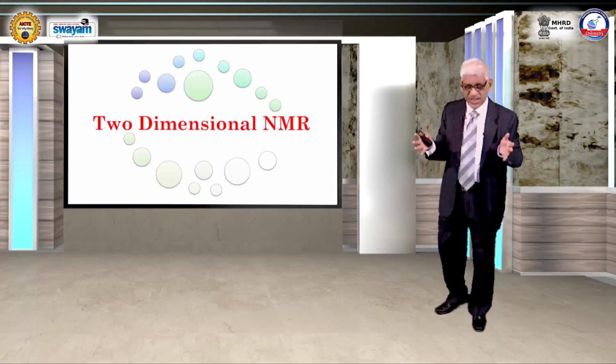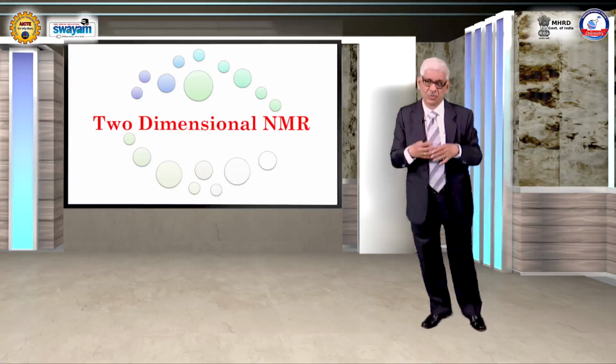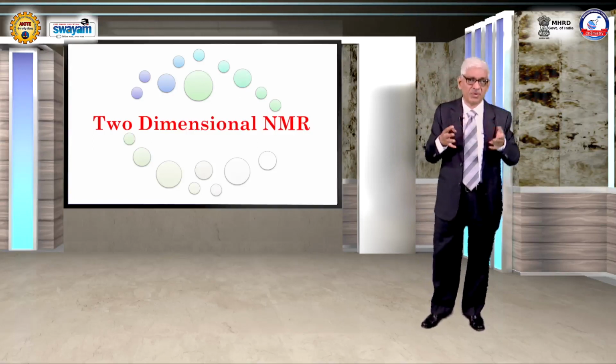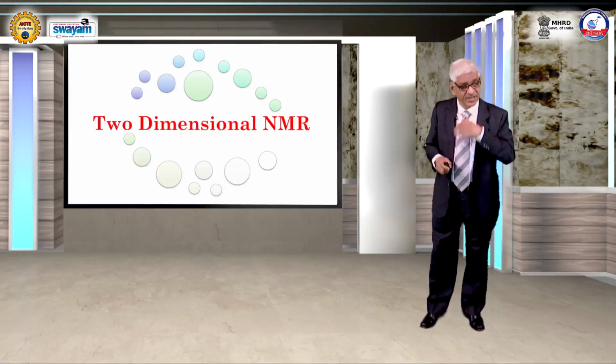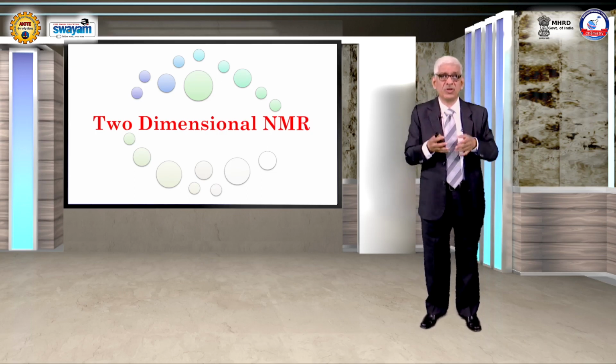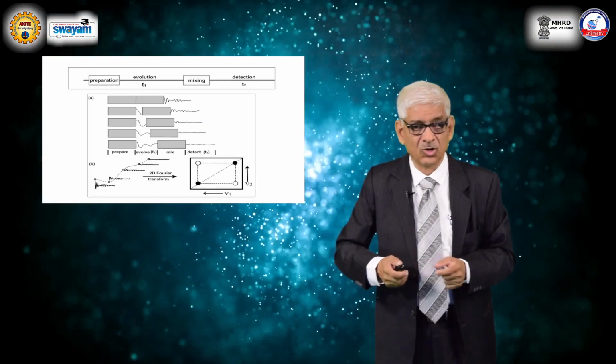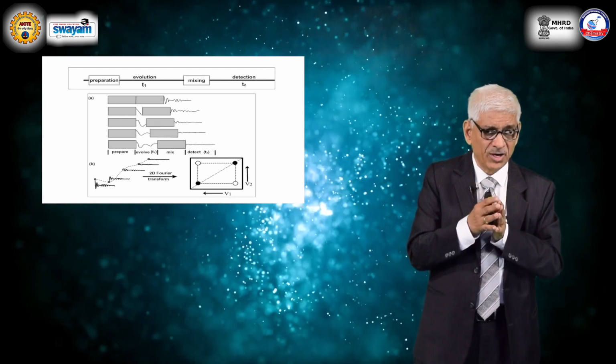Now, that was a major development with regard to NMR spectroscopy. The Fourier transform NMR was a major revolution. It increased the sensitivity of your NMR spectrometer manifold, and therefore you could actually do experiments with your molecules at natural abundance of carbon 13.